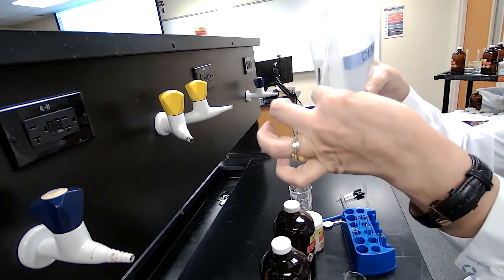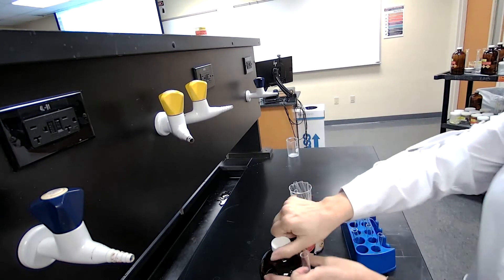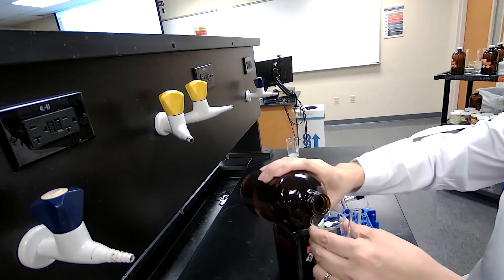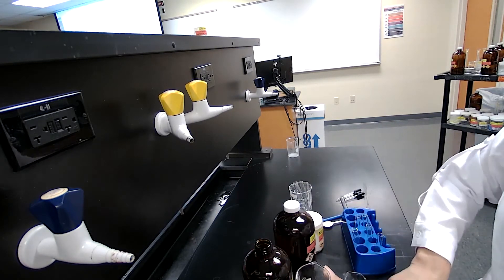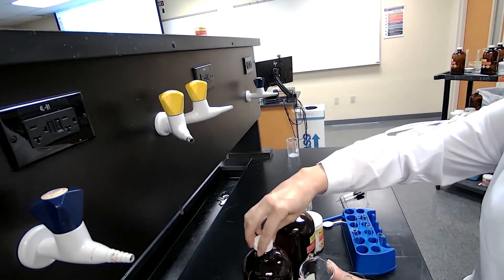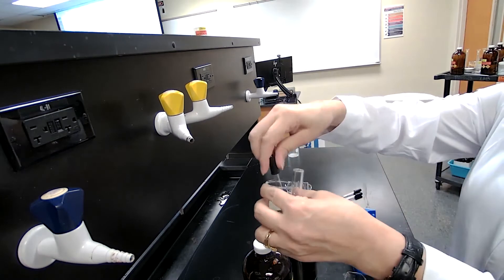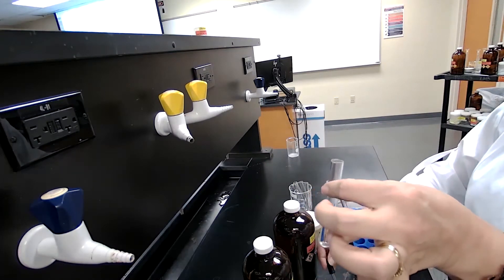Next is water plus hexane. I would add to the test tube about three milliliters of water and then one milliliter of hexane following the procedure. It's best for you to read the procedure before you watch the video so you have a better idea of every step and what is being mixed.